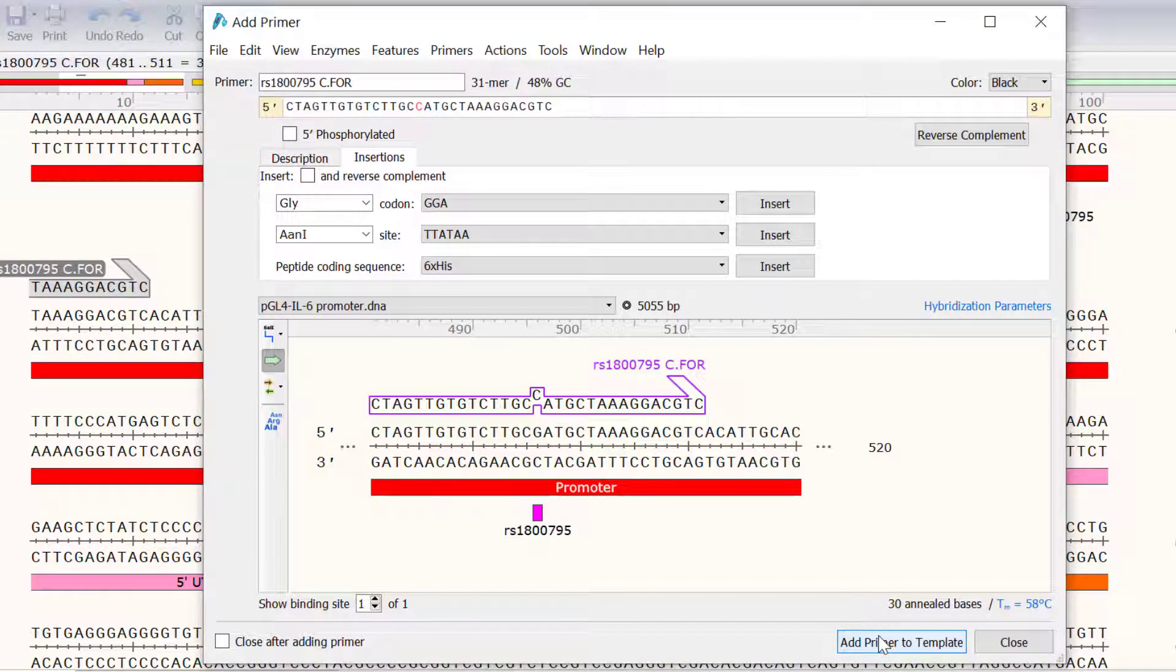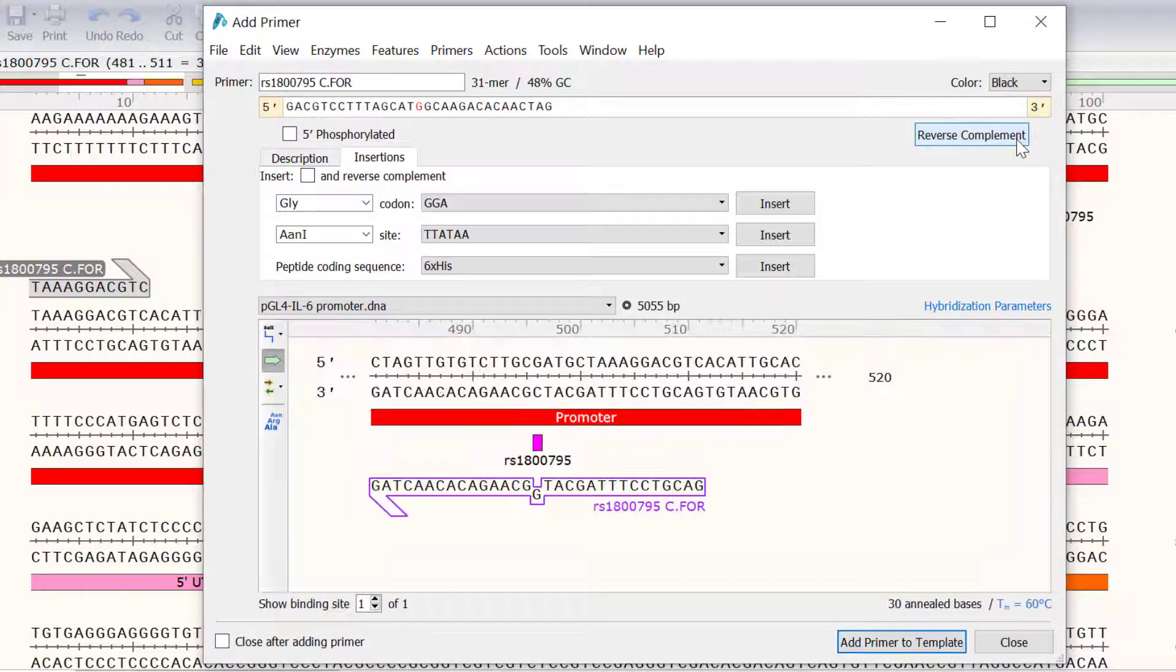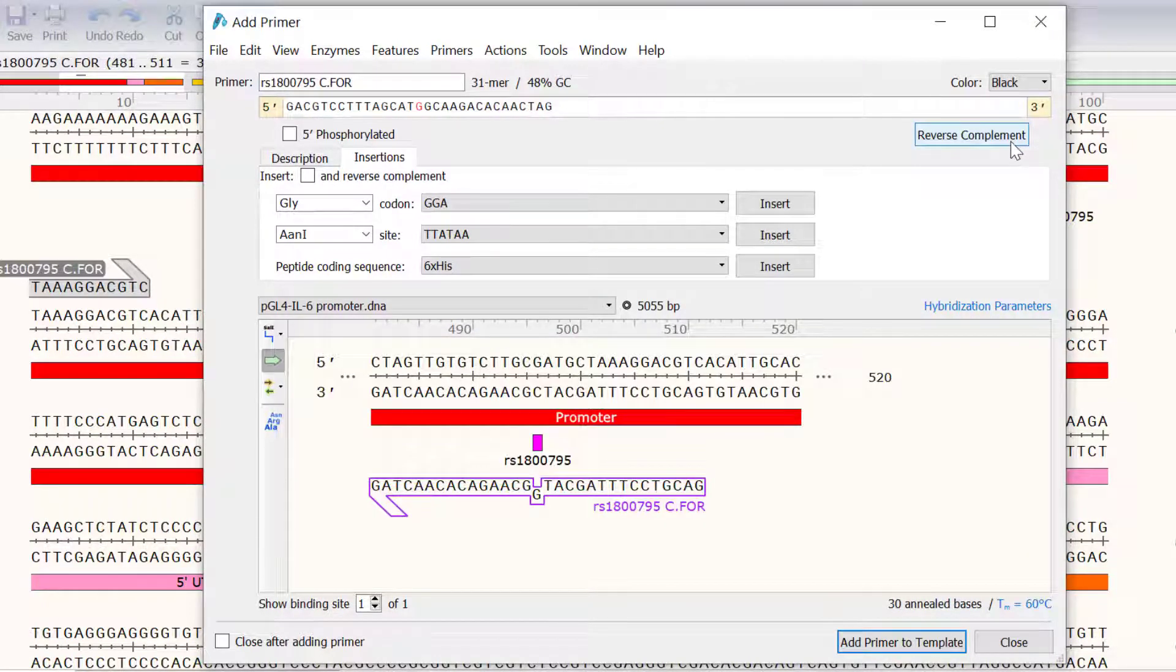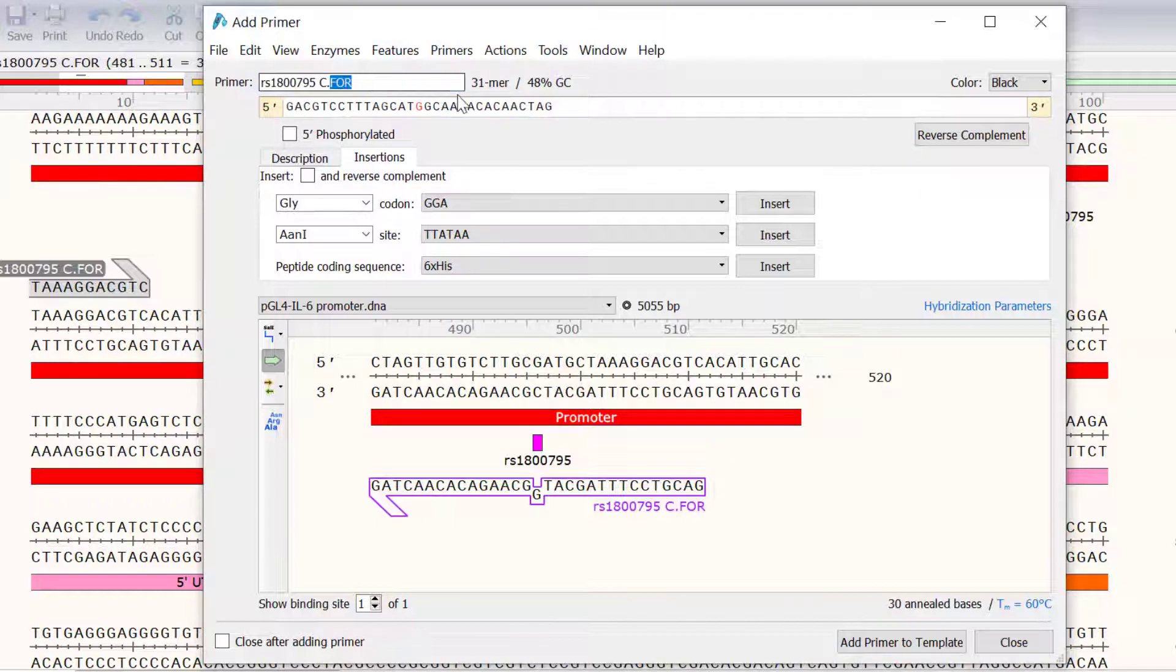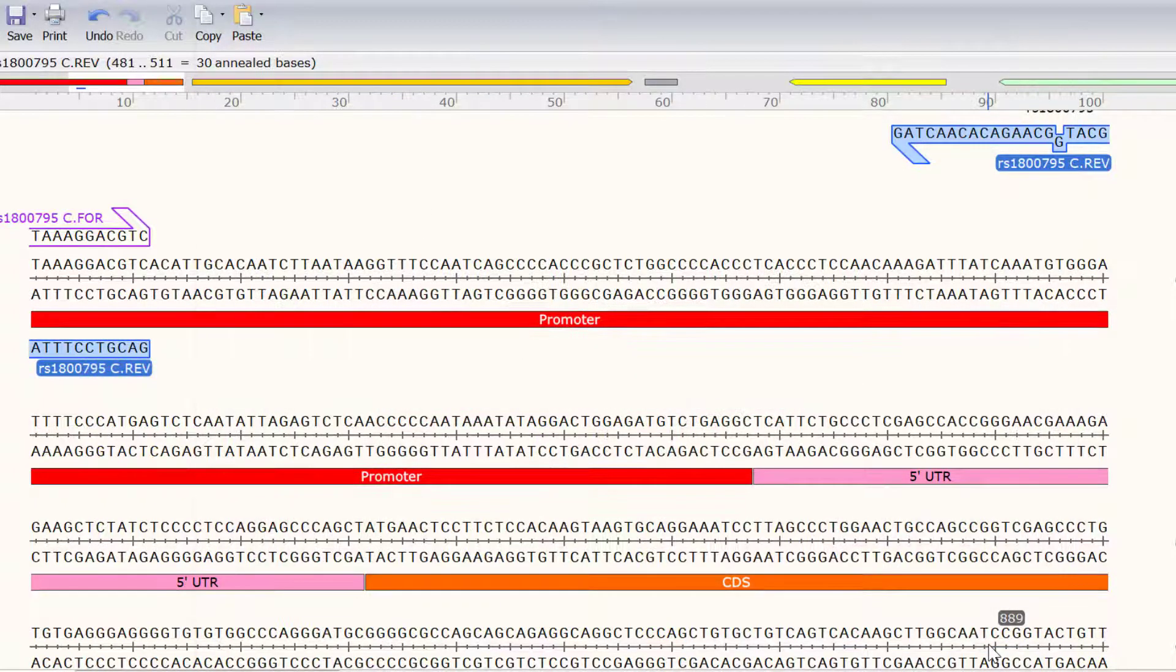To make the complementary primer, I will simply press the reverse complement button. I will also edit the name of the primer to RS1800795 C.REV and finally I will select Add Primer to Template and close the window.